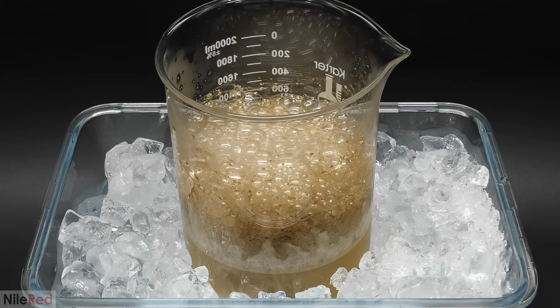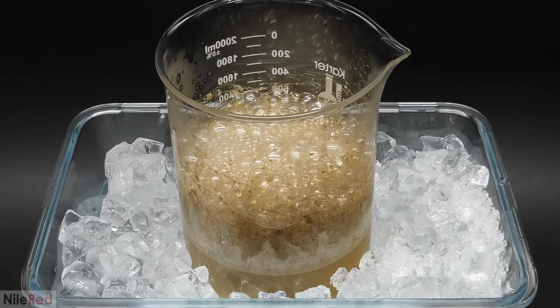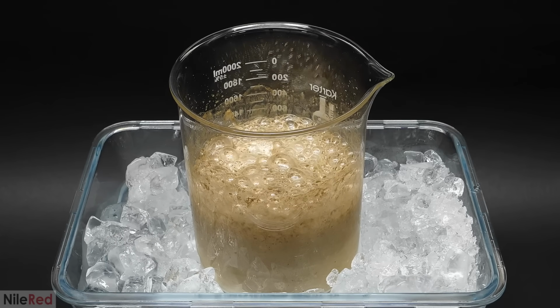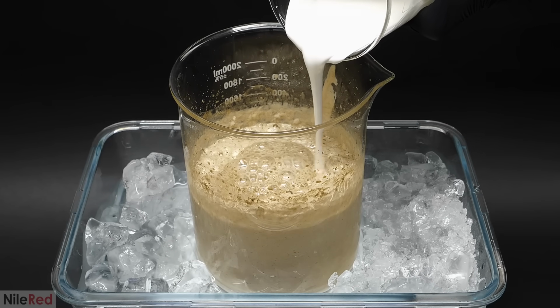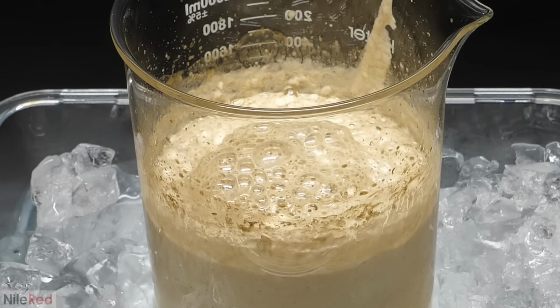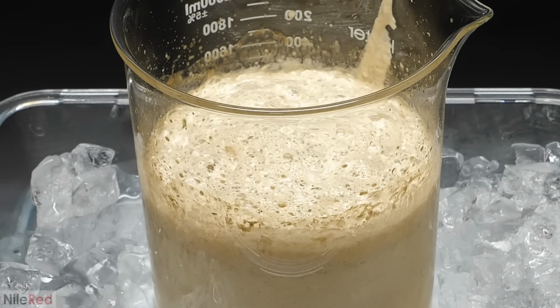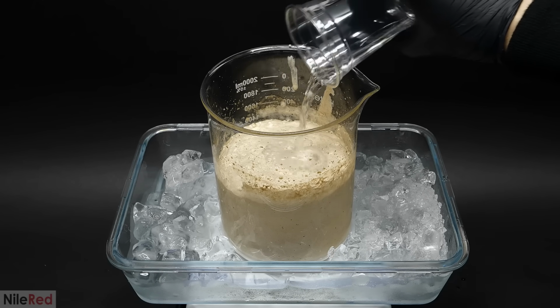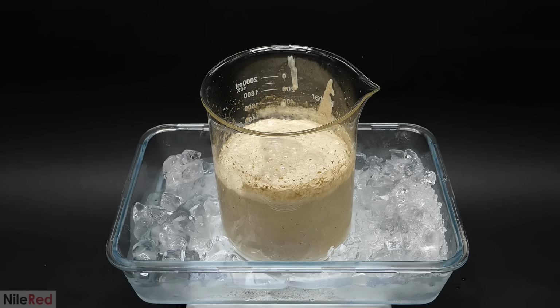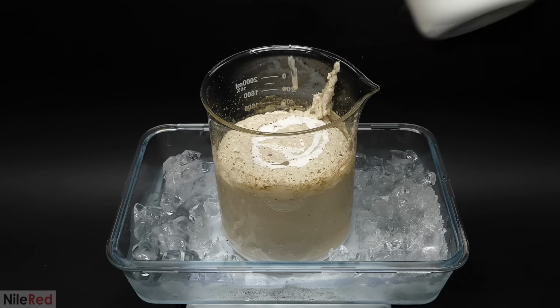The only problem was that I had to add the chalk in small amounts, or else it would bubble out of the beaker. This was a very slow process, and it was going okay, until it eventually got a bit too thick. This happened because the calcium sulfate was practically insoluble in water, and it was all separating out. So, to fix this, I occasionally added some extra water to loosen things up, and it seemed to help. I also added some more water to the chalk, and I slowly added the rest of it.